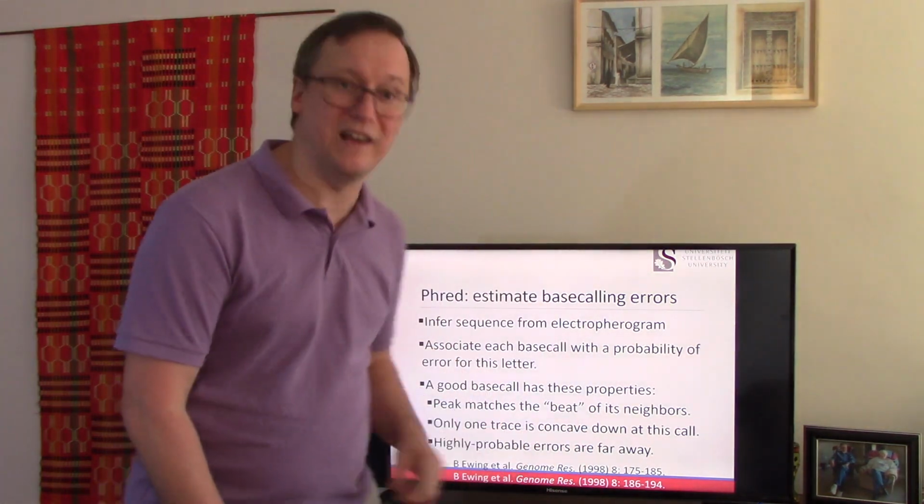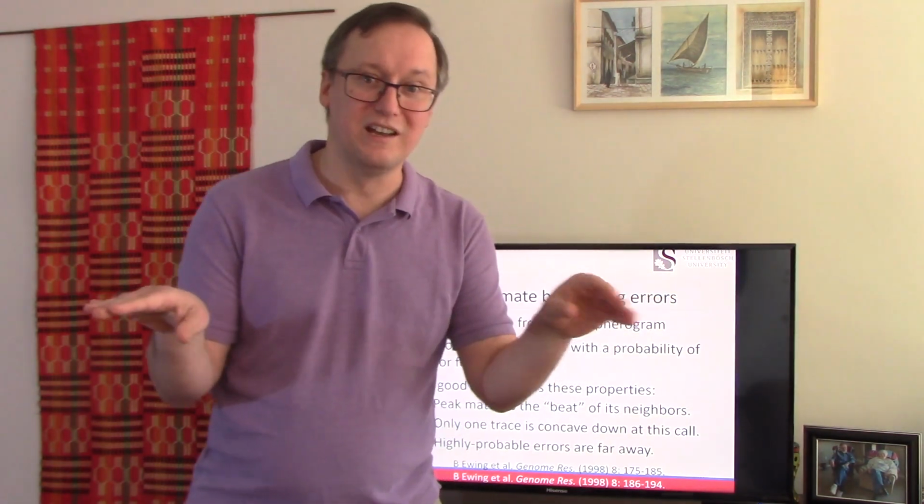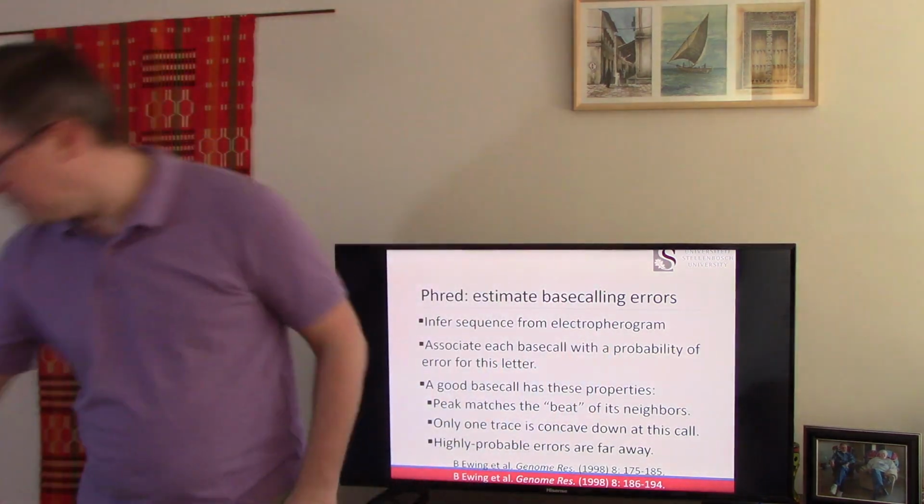Okay, so in the same way, when you're looking at sequencing data, if you have a particular peak in your electropherogram that's just garbage, we don't assume that the garbage is limited to that one base call. We assume that it's hindering the base call probabilities on either side of it. And the closer you are to that clearly garbage base call, the more your score is going to be hurt, in very much the same way as property values are held down because of those folks who keep selling drugs.